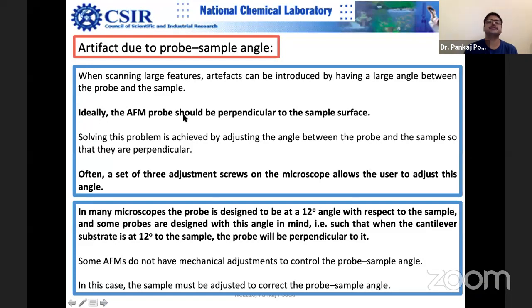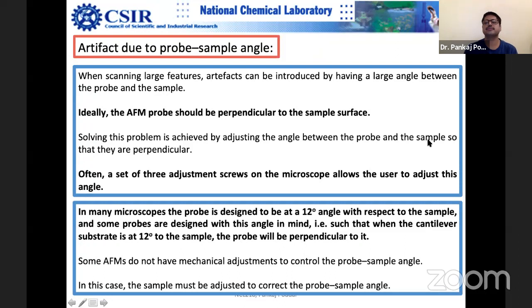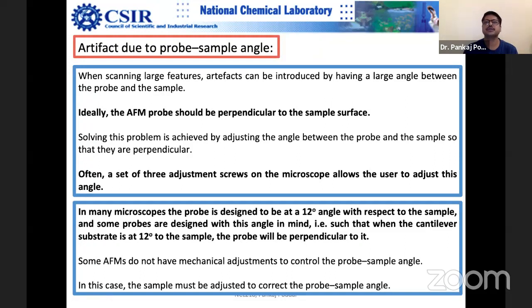The AFM probe ideally should be perpendicular to the sample surface. Solving this problem is achieved by adjusting the angle between probe and sample so that they are perpendicular. Conical tips are not very good for this purpose. The angle should be as large as possible.